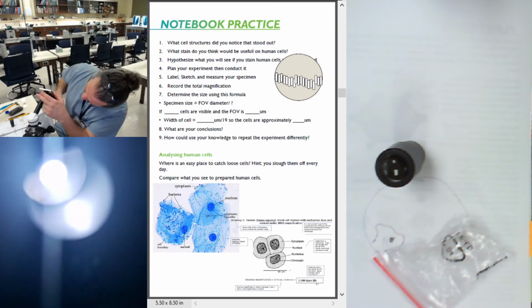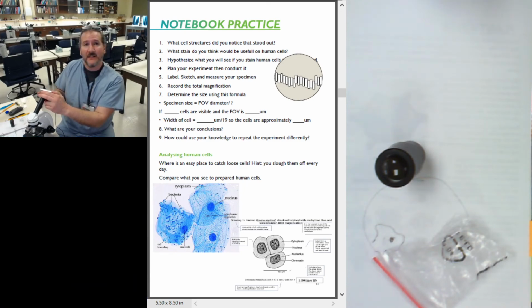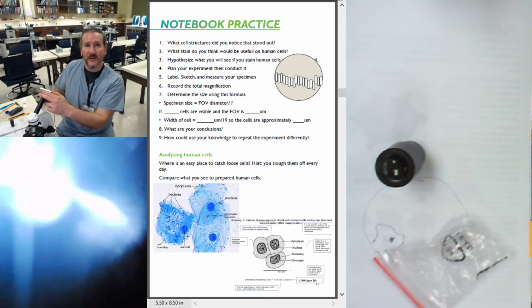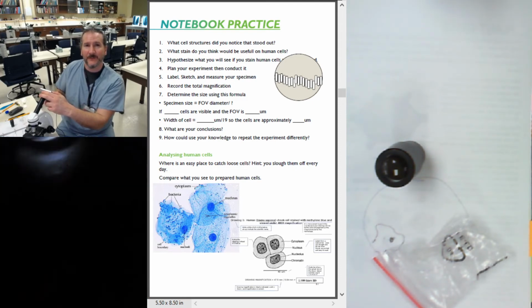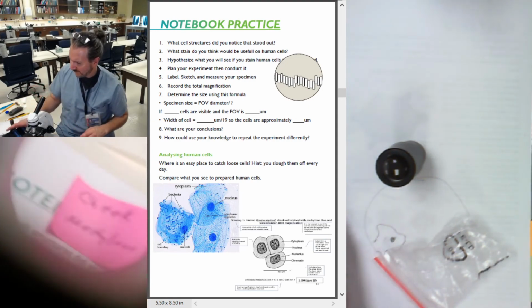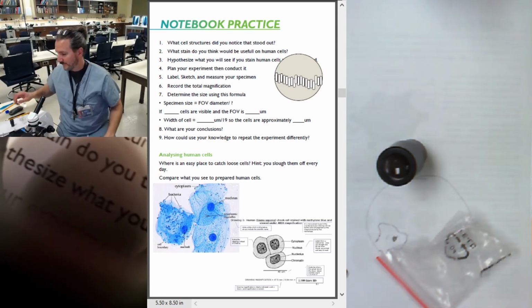So this camera actually has that area that's too big for the camera itself to be able to get in the circle. Not going to be able to line it up. So here's your task. I can see it with my naked eye. Some really nice cells.